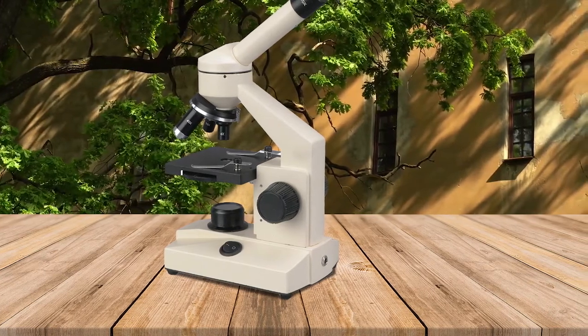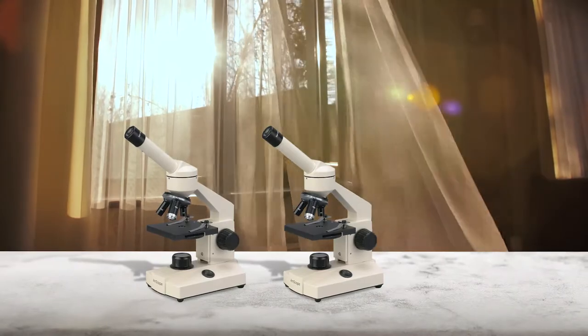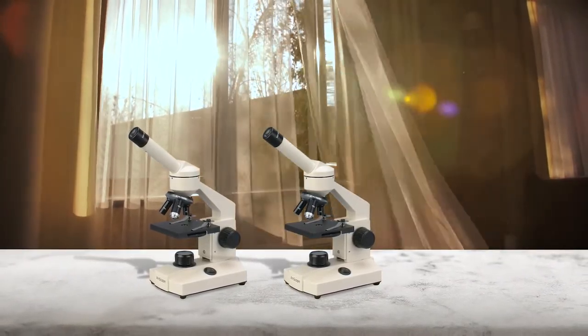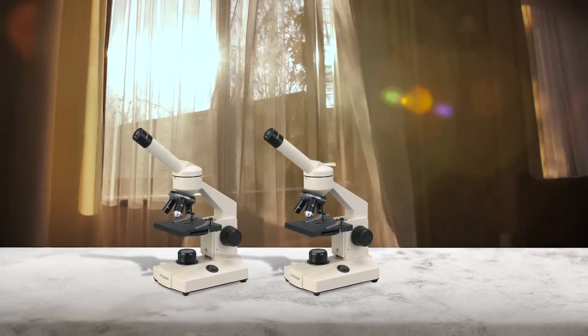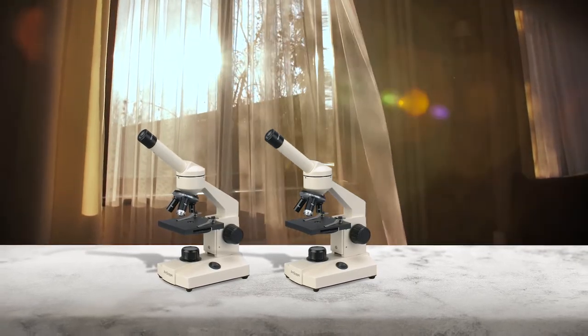It comes with all glass optical components and a solid metal body. The microscope provides fine, clear images and will last long enough to cover all paths from elementary to high school. Strong metal construction provides a stable image at high magnification levels instead of vibrating.